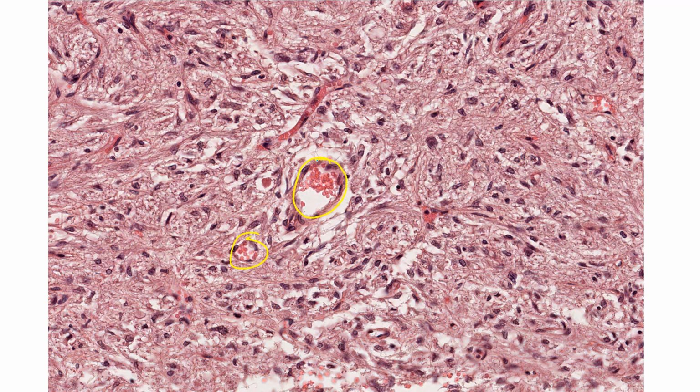So if you look in here, you can see several different capillaries. Here's one in transverse section. It's a little bit of capillary over here. You can see there's capillary everywhere. So the hormones are released from the axons via exocytosis. They make their way into the capillaries, and then off they go to wherever in your body they need to go to do their job.